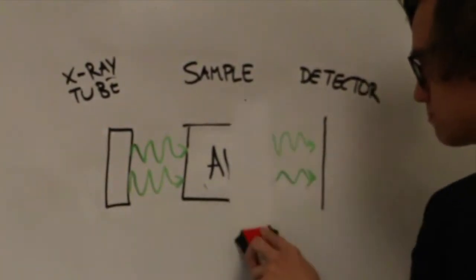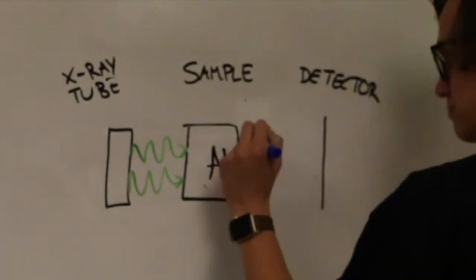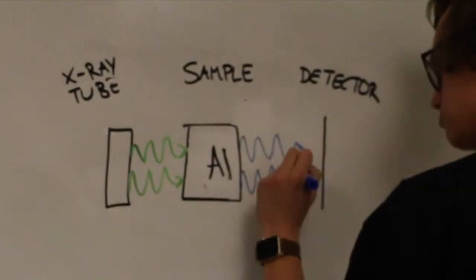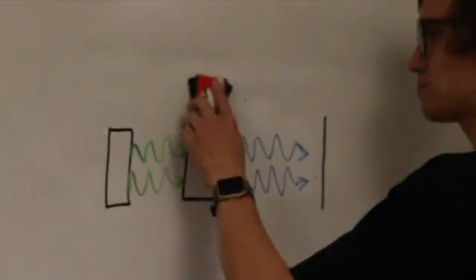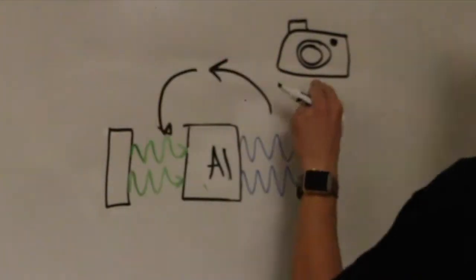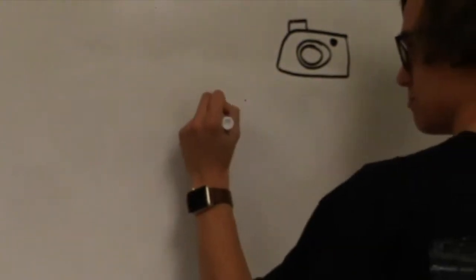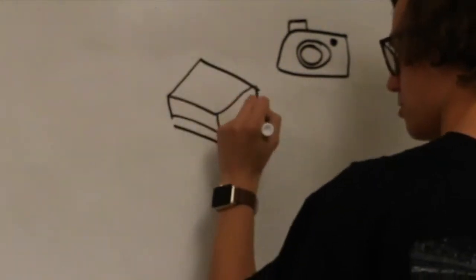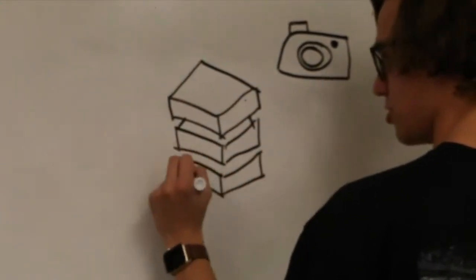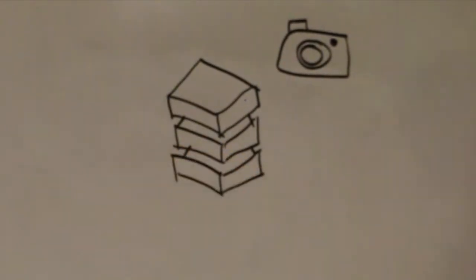Differential absorption depends on material thickness and atomic weight, with lower thickness and lower atomic weight yielding less X-ray absorption. This leads to varying intensities, creating contrast in the image. The specimen is rotated a fraction of a degree between scans until complete rotation is achieved. These image slices are processed and compiled by computational software, creating a 3D rendering of the sample. Images stacked together like how slices of bread create a loaf, or how Pringles create a delicious snack.